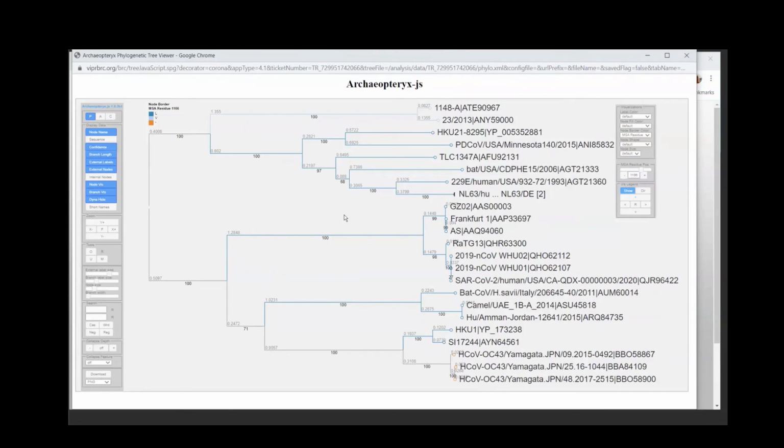If your data set is huge, some of the more accurate methods are simply not available because they're more time consuming. But if you can, I would say a maximum likelihood method like RAxML is probably one of the best you can do nowadays. And RAxML is really fast. Another really great program is MrBayes, which calculates Bayesian trees, but that unfortunately is not part of ViPR yet, but it might be in the future.